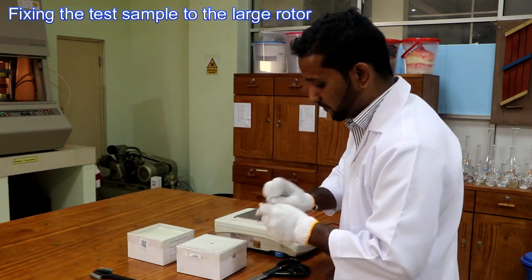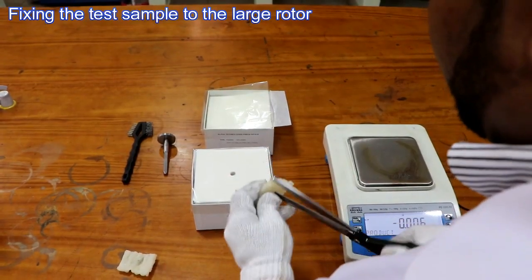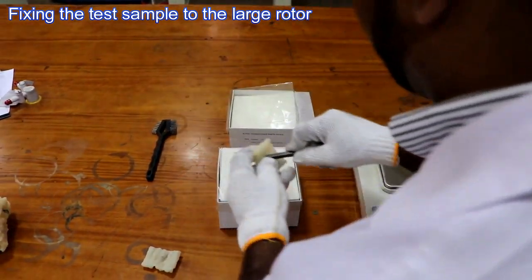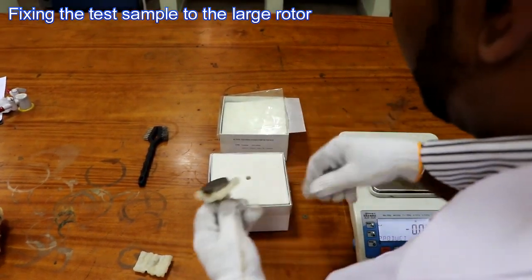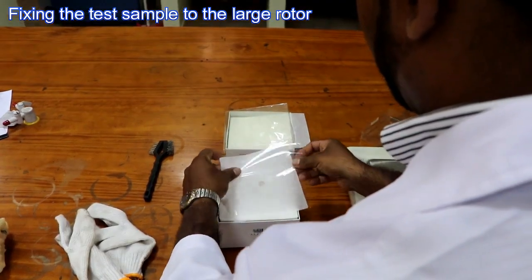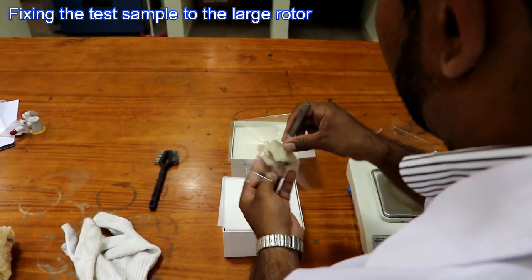Here it is the large rotor, and after fixing these two rubber samples, we have to place two polyester sheets at the bottom and top of the rubber sample to avoid the stickiness of rubber to the surfaces of the cavity of the Mooney viscometer.